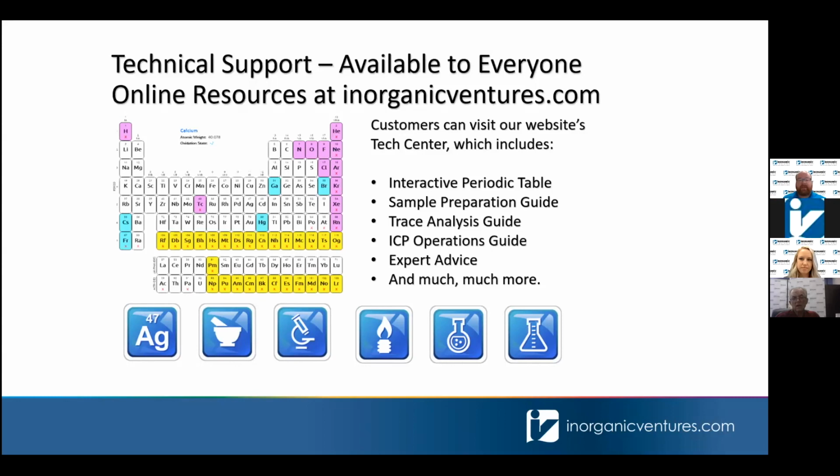All right, we have a couple more questions. We're going to pivot over to tin now. What concentration of TEA is recommended?